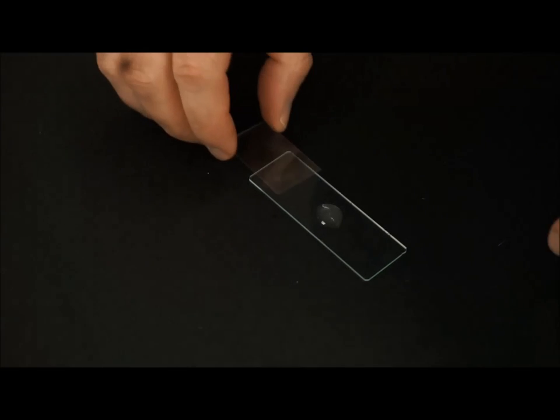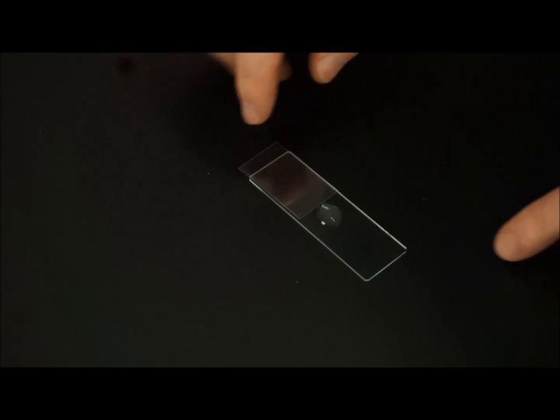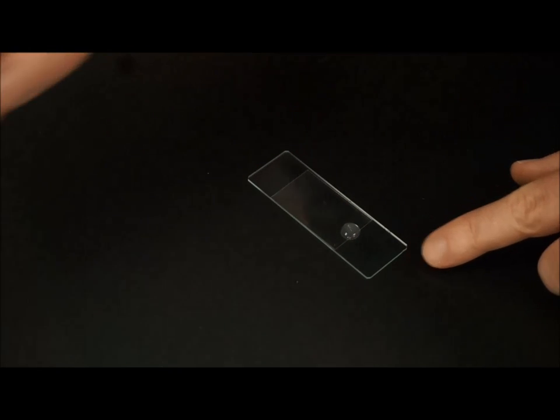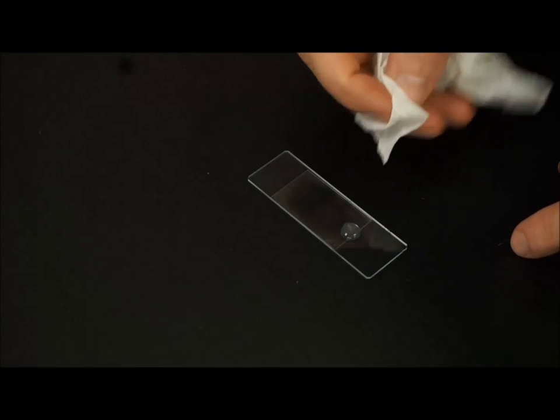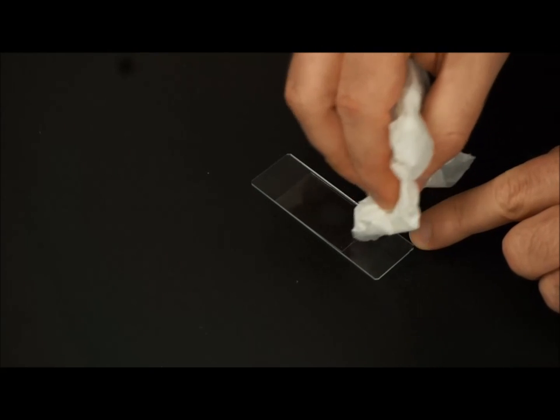You don't want to use too much, or else you won't get flow of the beads as they move through the fluid, and you don't want that. So we then take our cover slip, lay it down, and then gently push it into place. And then we can soak up the residue, and we're good to go.